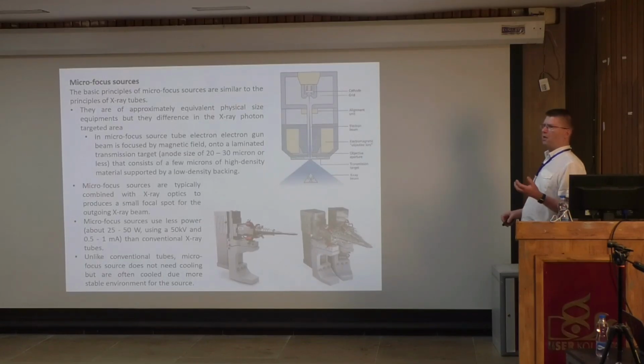And the only difference now is how you create the X-rays, mechanically or technically. And then we need the electronics and so on for this. But this is the current technology, and if you are going to buy a normal diffractometer now, very likely it will have this kind of a micro source available in there, either 1 or 2.